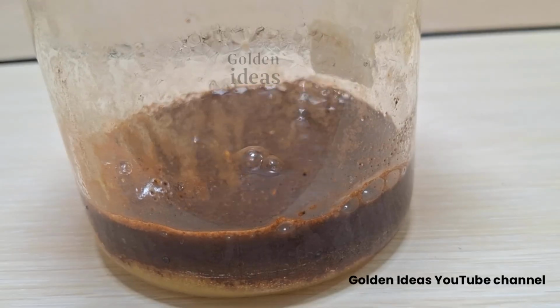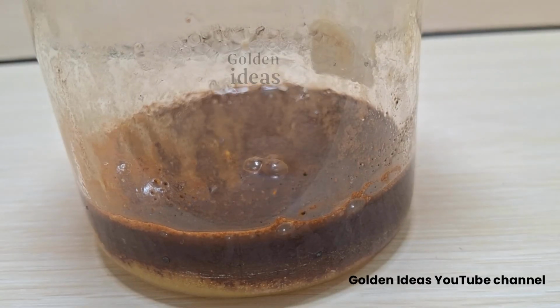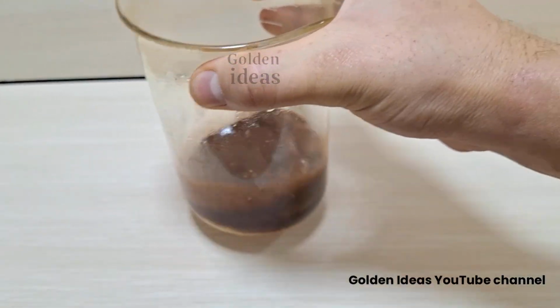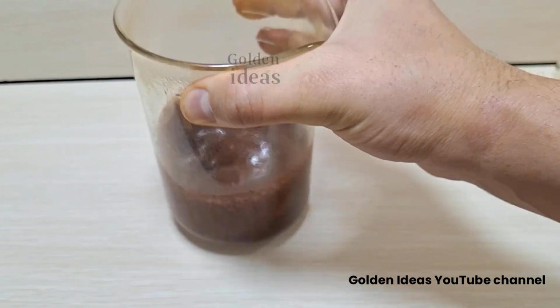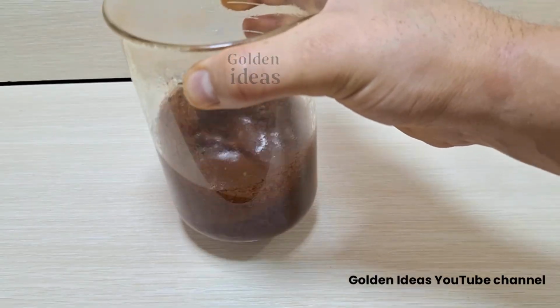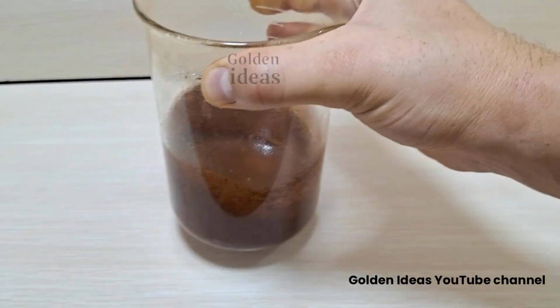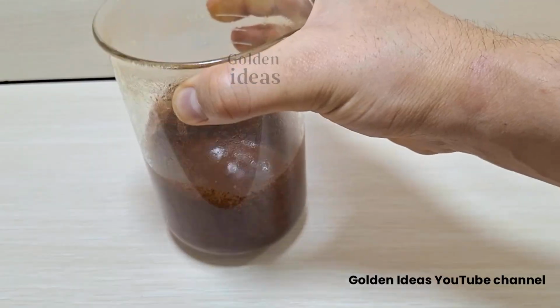This method is suitable for all oxide soils, and with a slight change, it is also suitable for sulfide soils, which I will make a separate video for sulfide later. The blue substance is used as a catalyst and changes its place with the gold and metal ions I mentioned earlier. As a result, the ions gain weight and are separated from the soil and go to the bottom of the container. The important point is that gold is not dense in the state of ions, but when the ions stick together, it becomes dense and settles. This happens naturally in nature and gold is found in the form of nuggets.